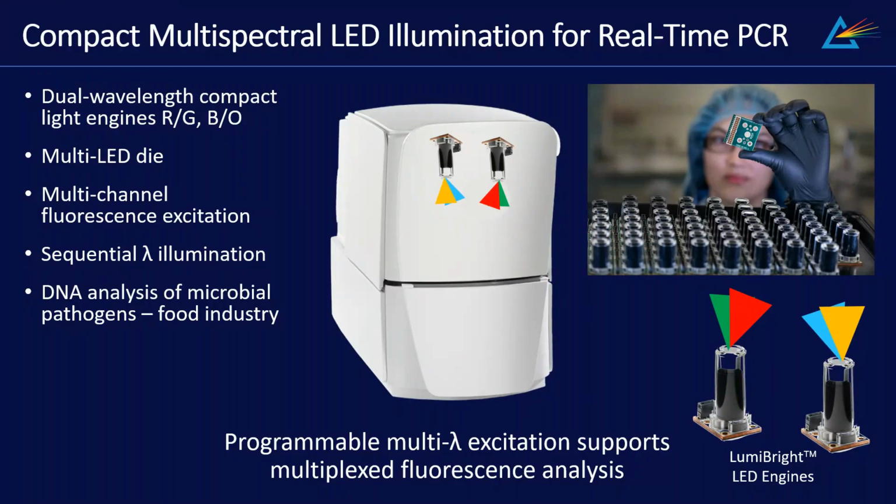Compact multi-die LED designs are especially useful in these instruments because space is often limited, and optical coupling efficiency directly affects fluorescence signal strength and measurement sensitivity. High-speed electronic control also enables rapid wavelength switching and synchronized detector operation during fluorescence acquisition.